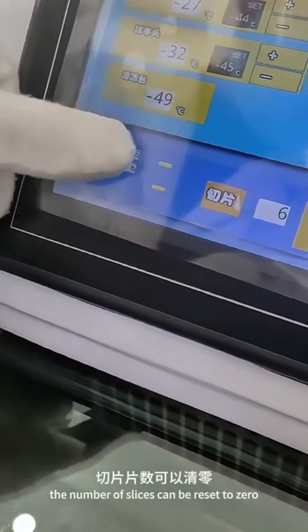For sample injection, the number of slices can be reset to zero.